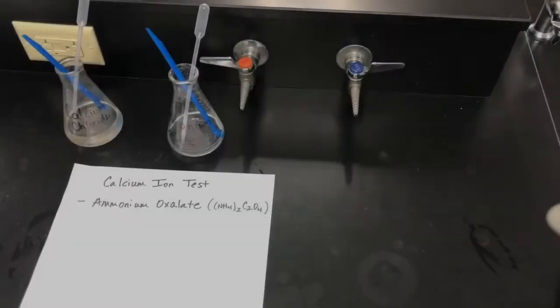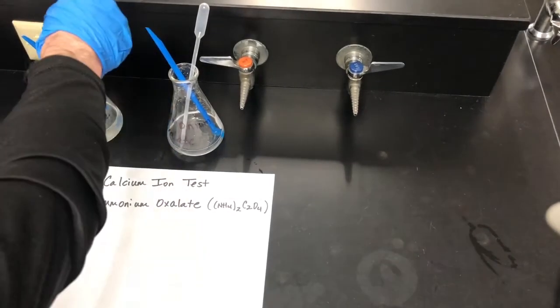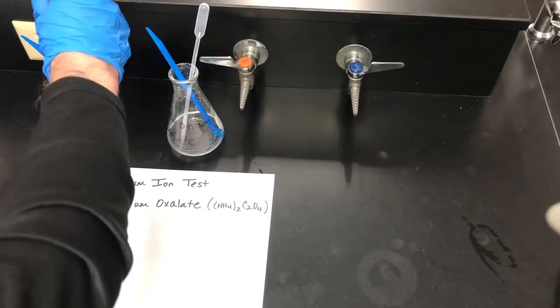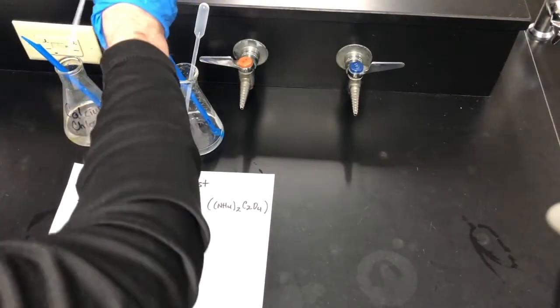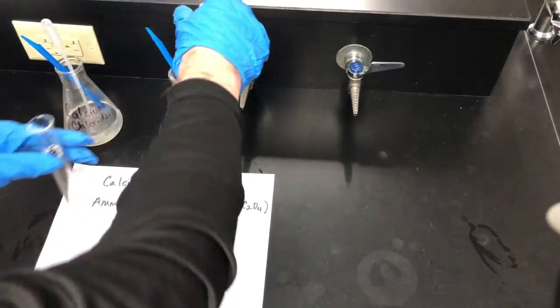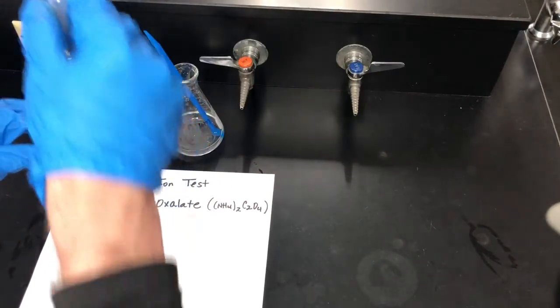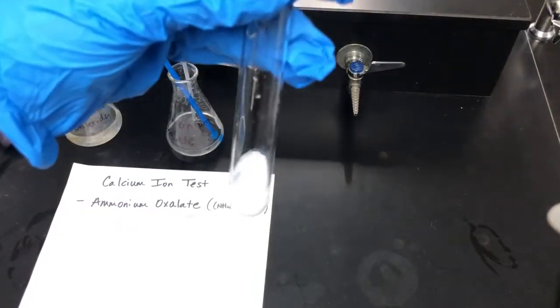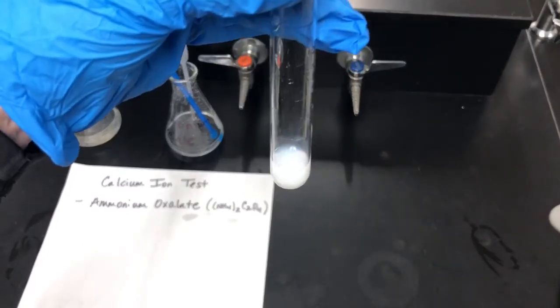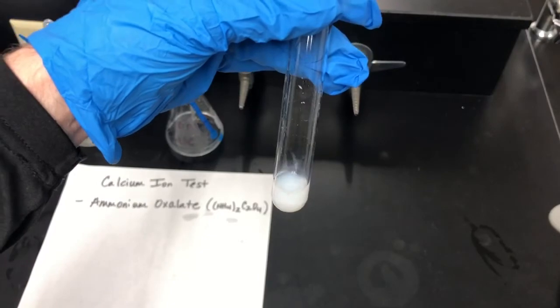The next test we're going to look at is the calcium ion test. Okay, so what we're going to do is we're going to take calcium chloride. I squirt calcium chloride, and it says we're going to mix it with some ammonium oxalate. So an ammonium oxalate right there. Okay, as you can tell, a white precipitate was formed.